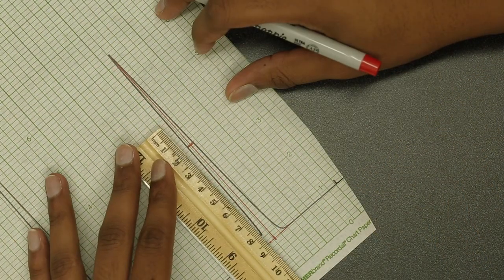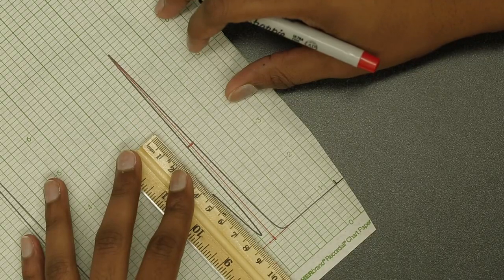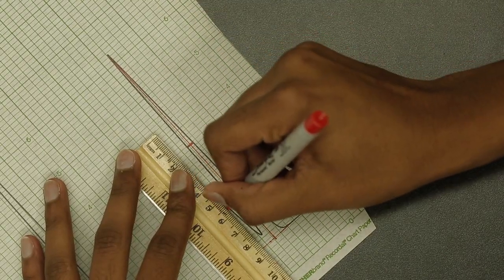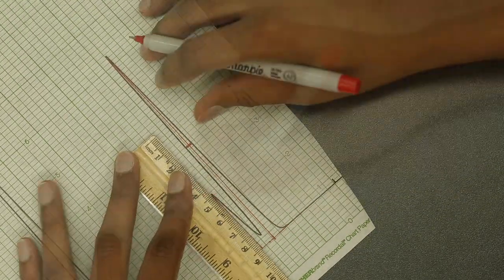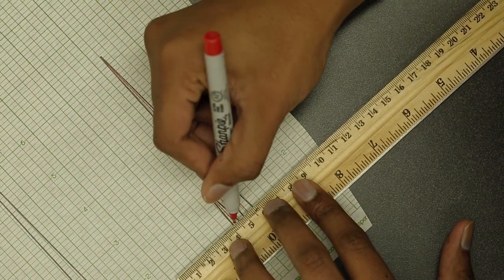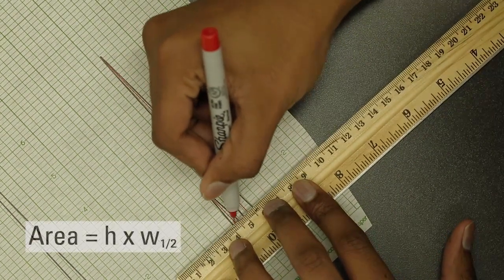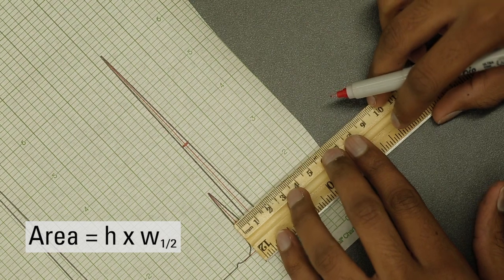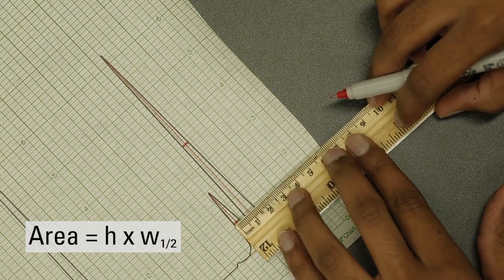Now let's do the same thing for the smaller peak. To calculate the area, measure the height of the peak from the baseline and measure the width of the peak at half height. The area of the triangle is equal to the product of the height times the width at half height.